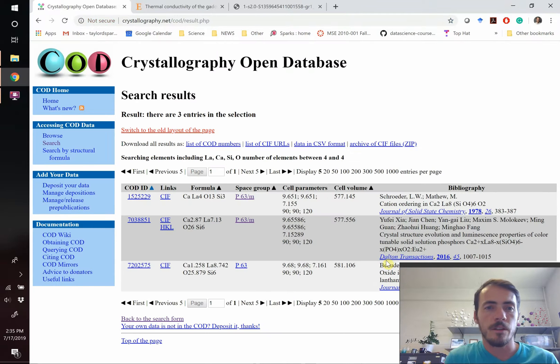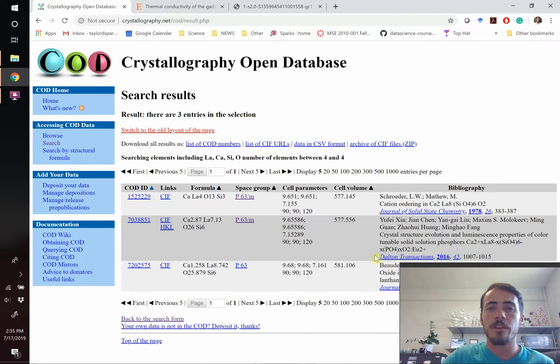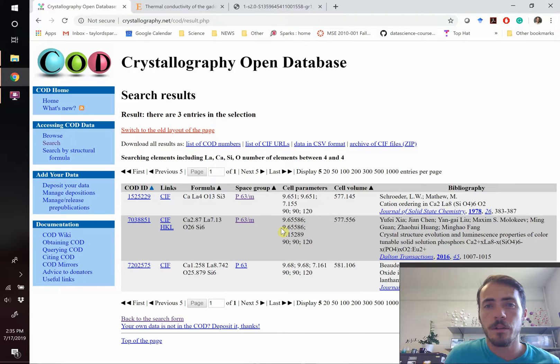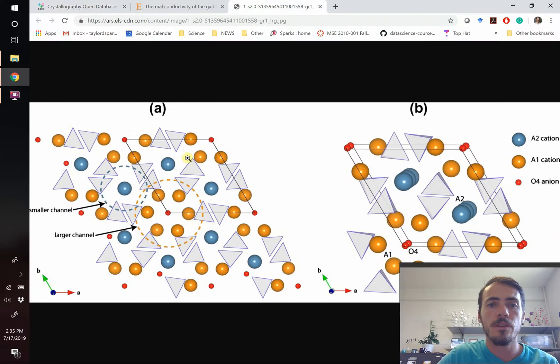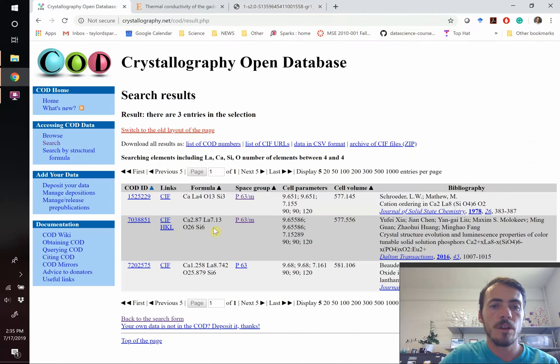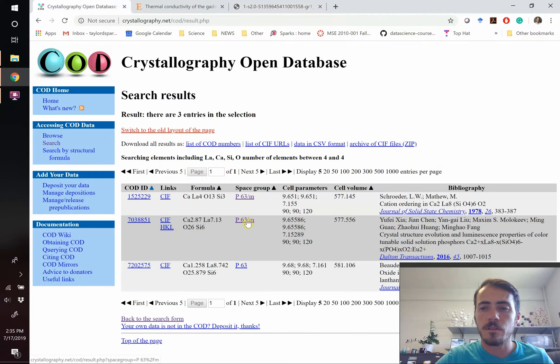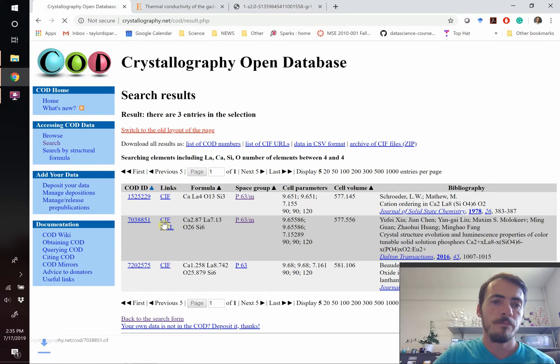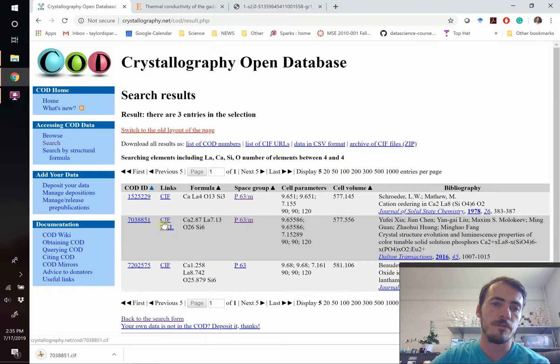And sure enough, we get some candidates that hit. Now again, these will have different lattice parameters. You changed an ion. They might have different site occupancies, but we're still going to be able to make this figure pretty accurately. So let's go ahead and grab this. Remember we wanted the P63/M space group. So we're going to grab that one, download the CIF file, and we'll open it up in Vesta.